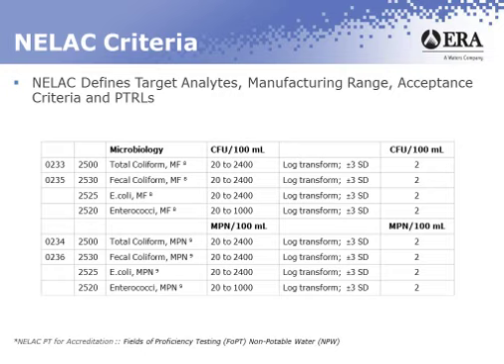They were groups of experts representing the EPA, state agencies, the PT providers, the laboratory community. They got together and actually defined this, not just for microbiology, but for chemistry and all the parameters. And this is really the skeleton of the criteria that drive the proficiency testing samples.